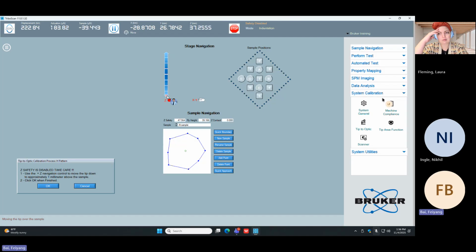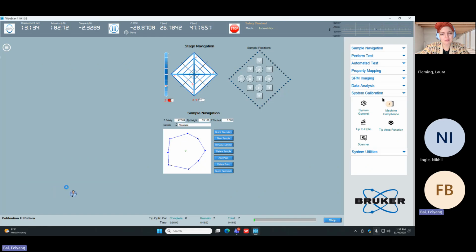You can go to the 58 further. Time I drive is slow. It's hard on the TS77 too, because you've got a weird angle to look at. It was easier on the 950. Yeah, I guess it's okay. You can go auto to 49. I'll let it drive slowly itself.